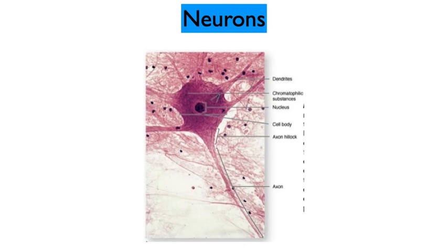maybe this is going to innervate a muscle cell and get the muscle cell to contract, or maybe with a subsequent neuron so that we can have the message, the electronic message, passed from one cell to another along a particular pathway, maybe in the central nervous system, in the brain, or in the spinal cord, and this one looks like it's probably a motor neuron.